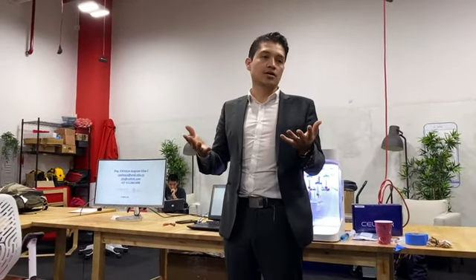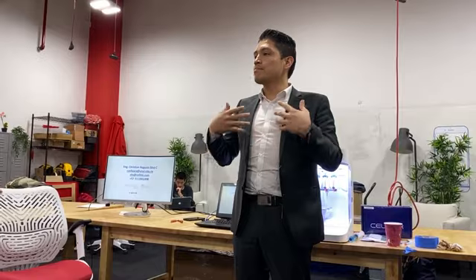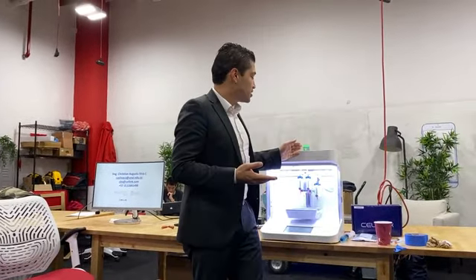of this kind of technology, right? So that is my main purpose, to show the technology, to show the biomaterials, and what I expect to do in the future with this technology, right?